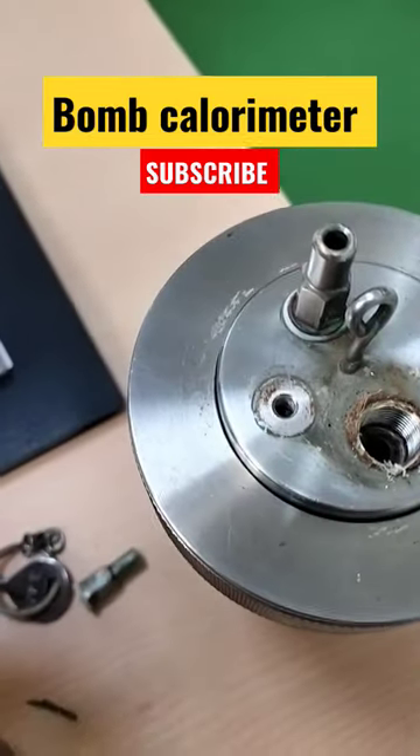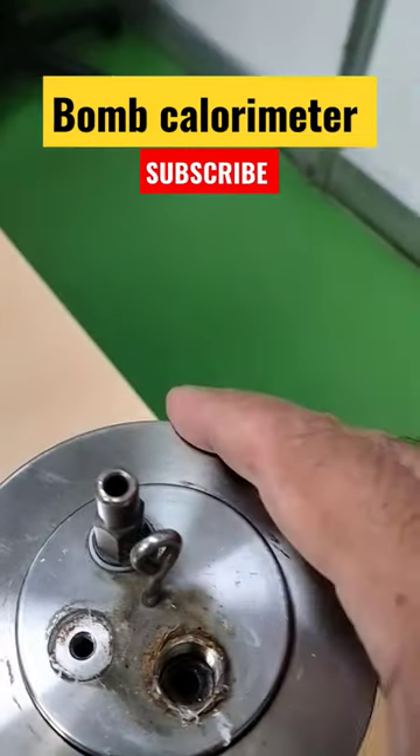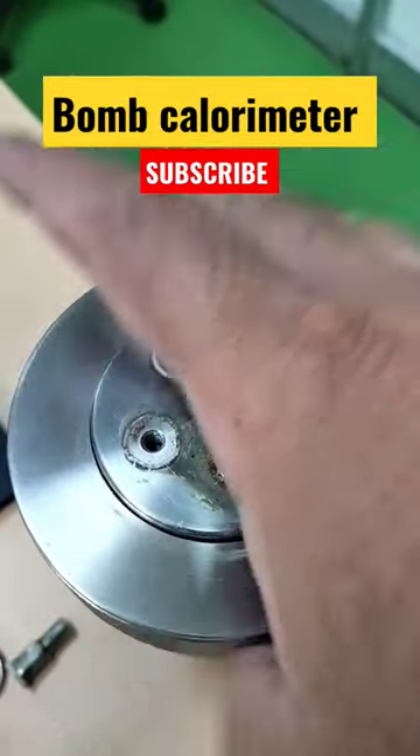A Bomb calorimeter provides a simple, inexpensive yet accurate method to determine the heat of combustion, calorific value, and the sulfur contents of solids, liquids, and fuels.